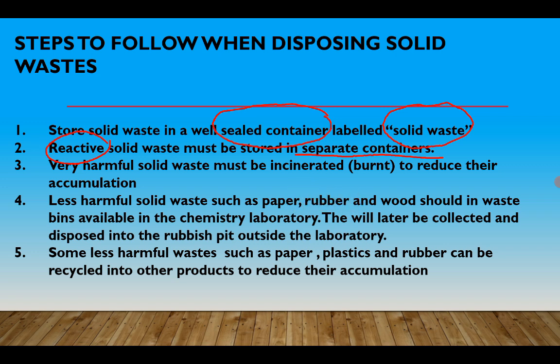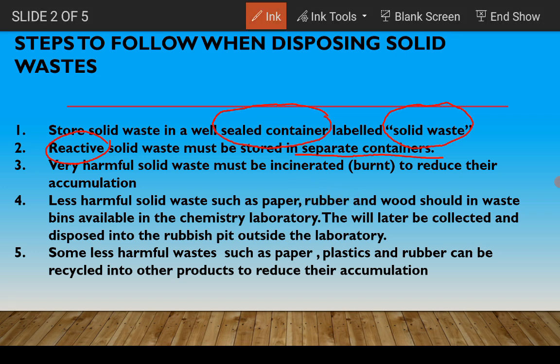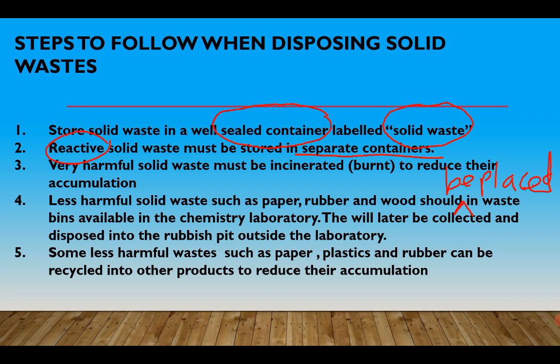You should place them in waste bins which are available in your chemistry laboratory. Then these will be collected and disposed into a rubbish pit outside the laboratory.